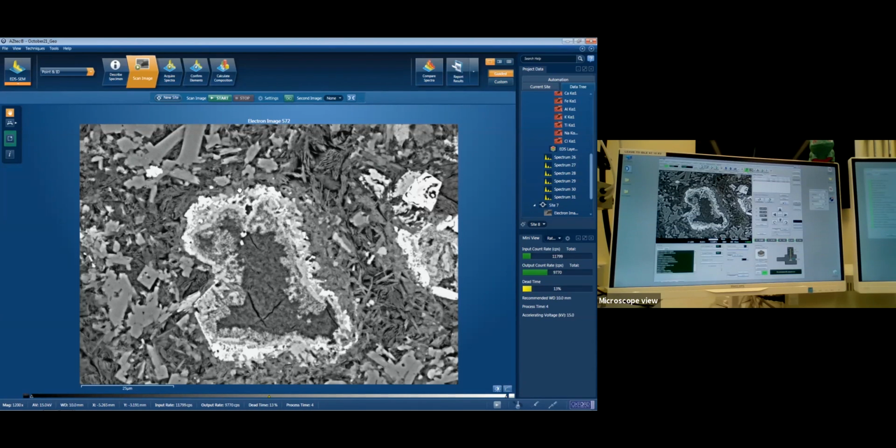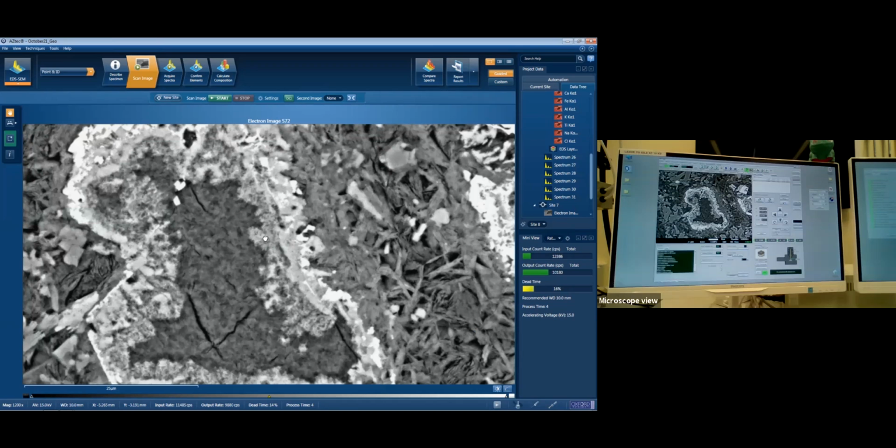But we'll leave you on this little splodge of titanium up here. Because if we zoom in a little bit, you can see this sort of fuzzy intergrowth through here. These are tiny little iron crystals that are starting to grow, and unfortunately just didn't quite make it into anything big before it got dug out the ground.